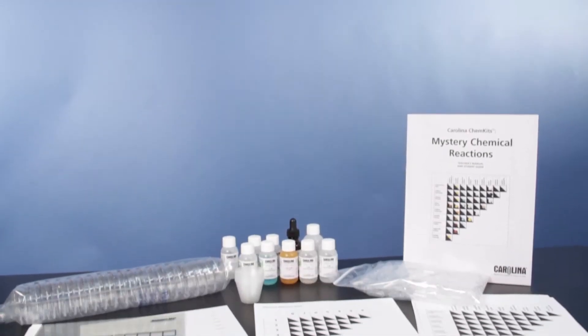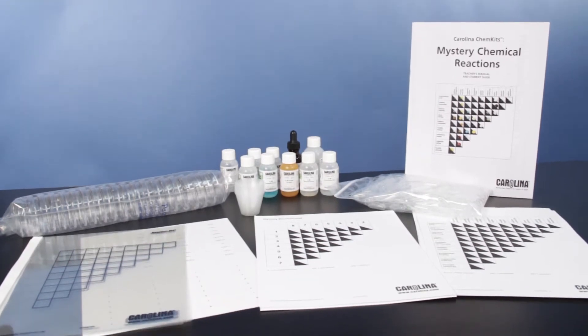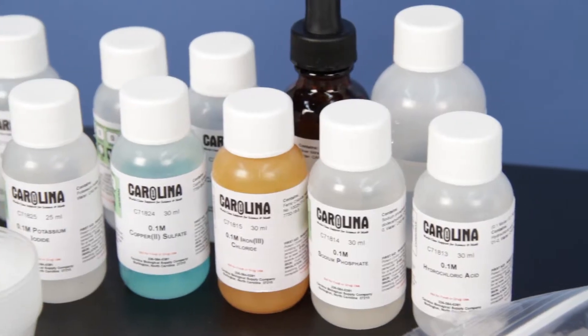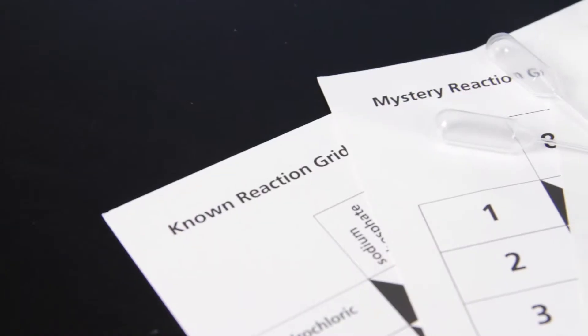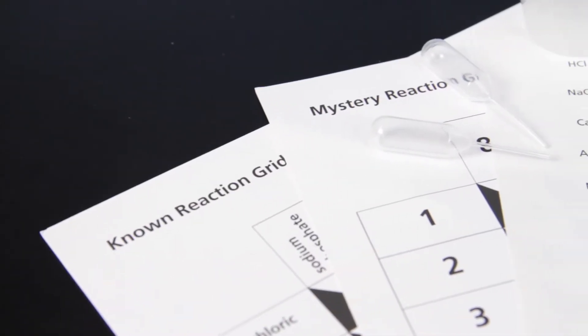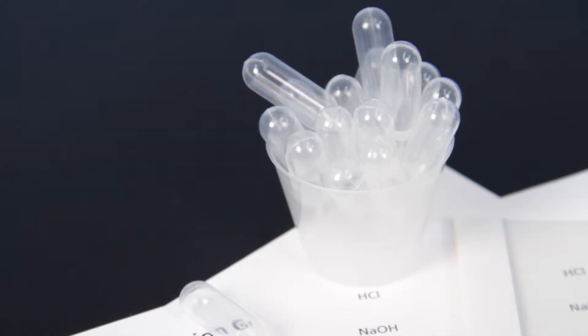Introduce students to a method of identifying unknown chemicals by their reaction types with the Mystery Chemical Reactions Chem Kit. Students investigate 45 different chemical reactions between 10 different chemicals in this guided inquiry microscale chemistry experiment.